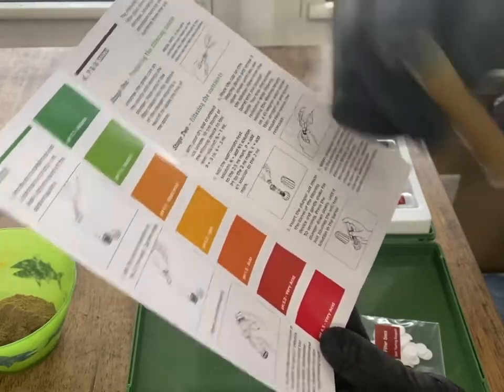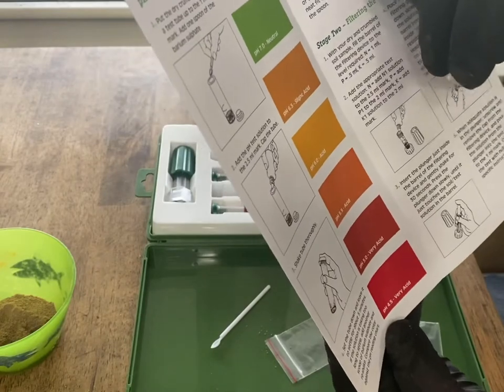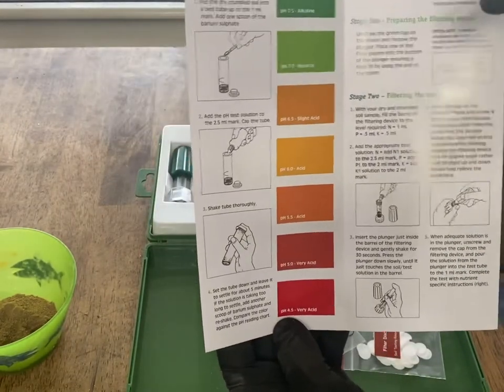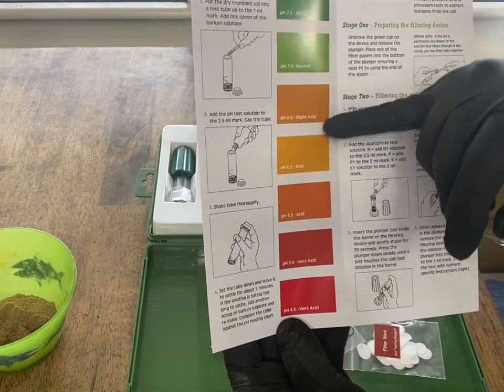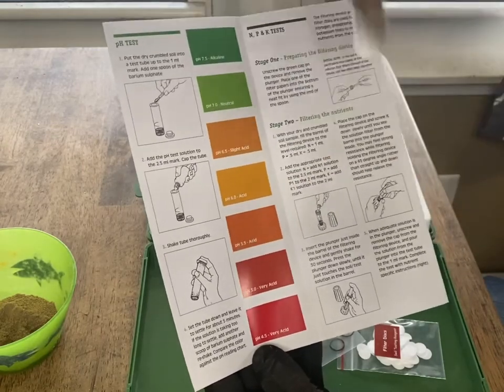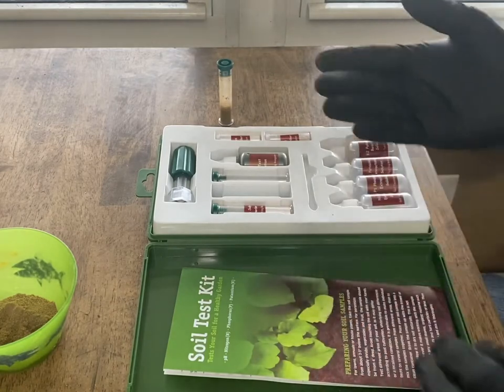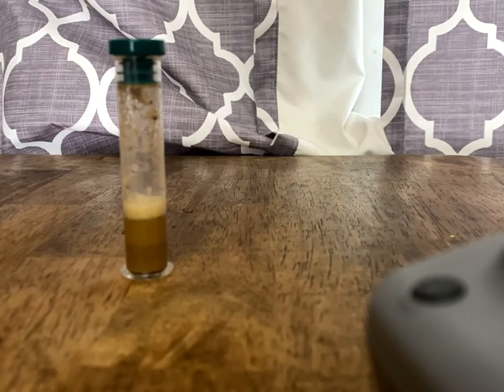It doesn't say for how long, but after you shake it thoroughly it says to set the tube down and leave it to settle for about five minutes. If the solution is taking too long to settle, add another scoop of barium sulfate and reshake. Compare the color against the pH reading chart — dark green is alkaline, red is very acidic. I want to be around 6.2, somewhere in the slight acid range. One last shake for freedom and I'm just going to sit this over here and let that settle.